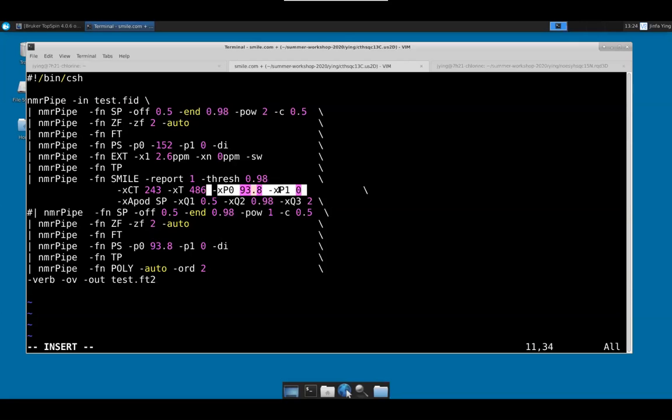So it's very critical that you apply the right phase correction, okay? Now, some people may not know what their phase correction is. What you can do is run the version without SMILE and pick up the strong peaks and phase them, okay? Even for 3D, 4D NMR, you can always do that. Expand them, zero fill, process them just as if it's fully sampled, and check the phase.